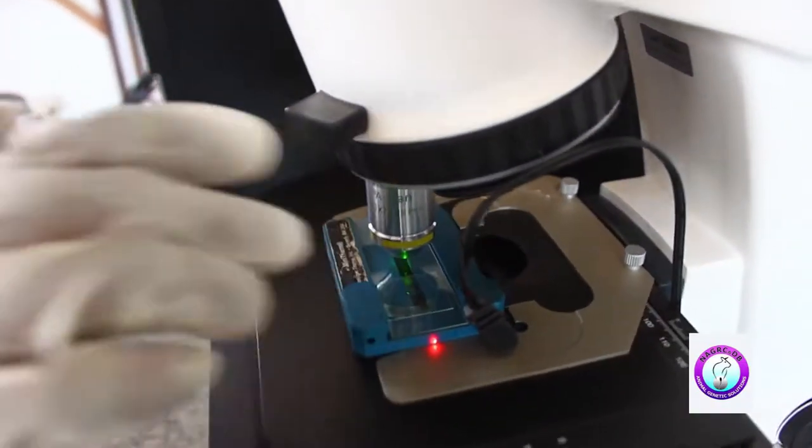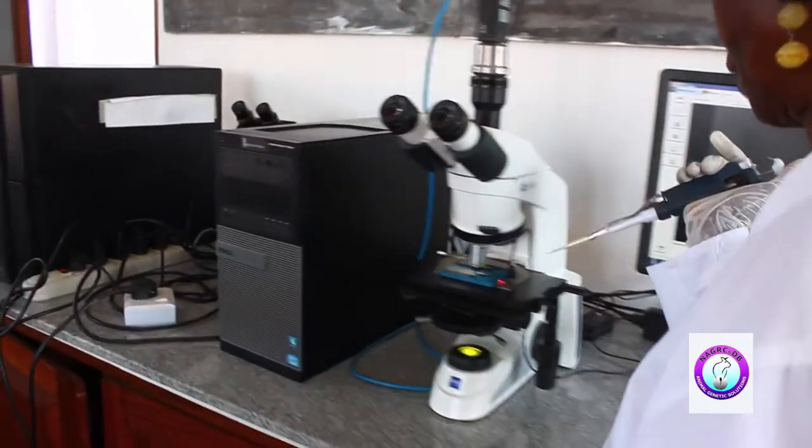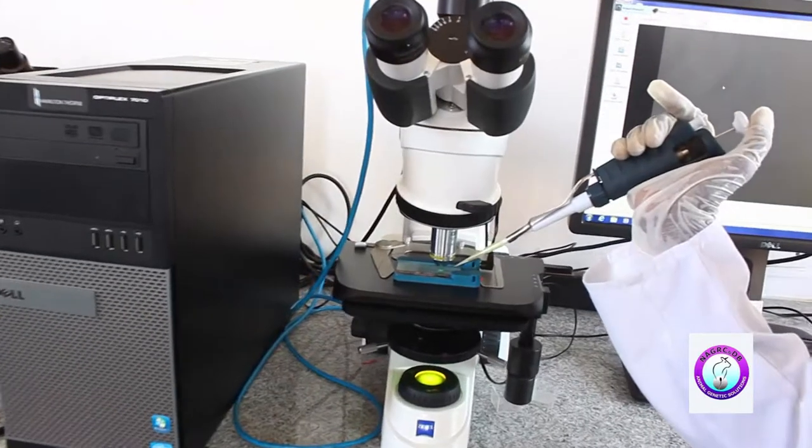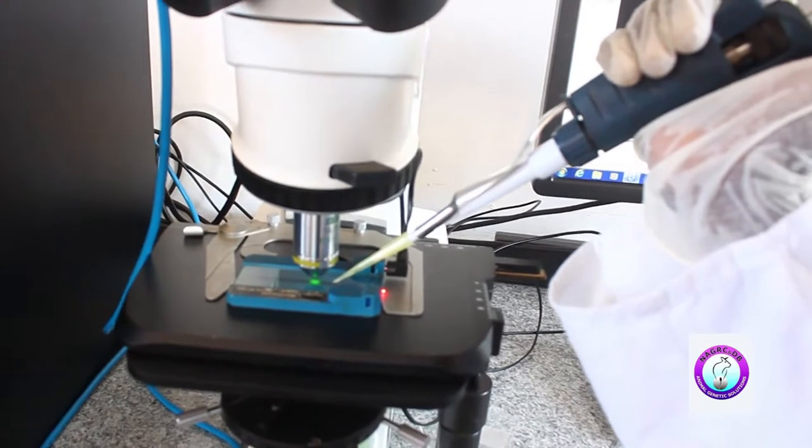And the microscope, what do you look at? Individual sperm cells. Because we are interested in live sperm cells and progressive sperm cells. That's why we look at them under the microscope. So what I did, I got a pipette, picked a sample of semen, put it on a slide under a microscope and covered it with a cover slip. The cover slip was just to spread the sample. After you spread the sample, you are able to see the semen clearly.